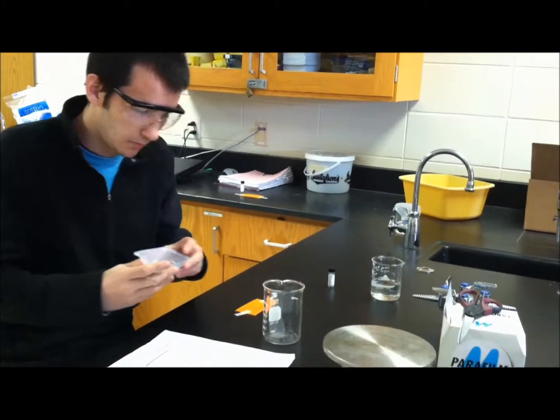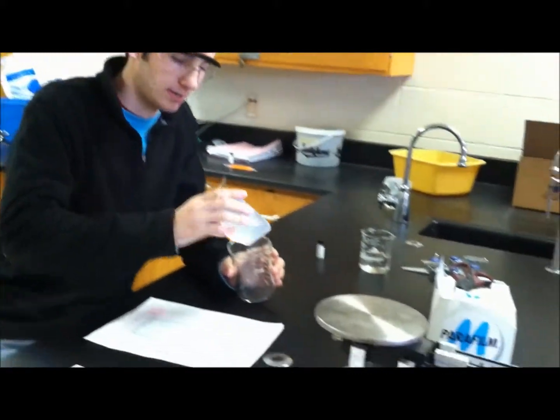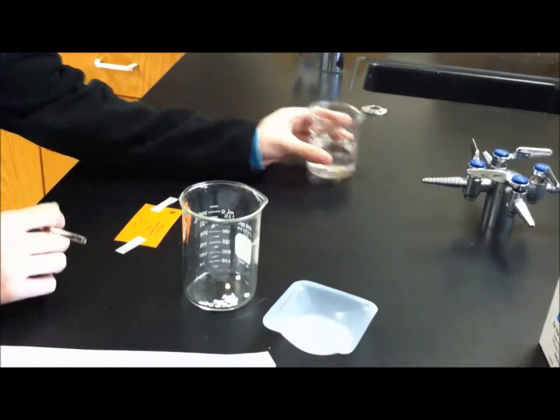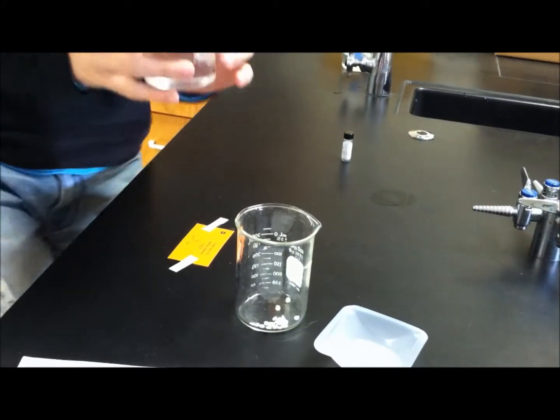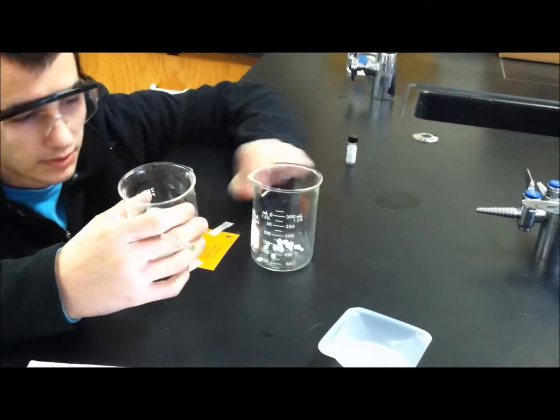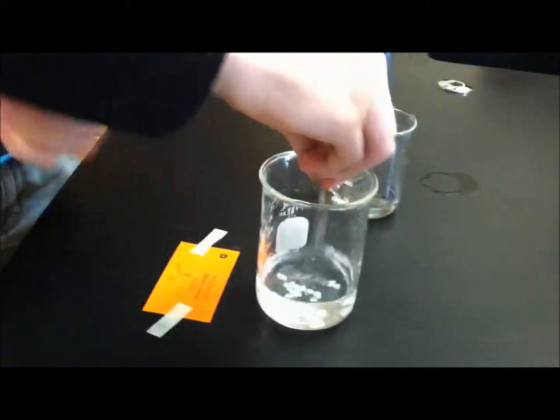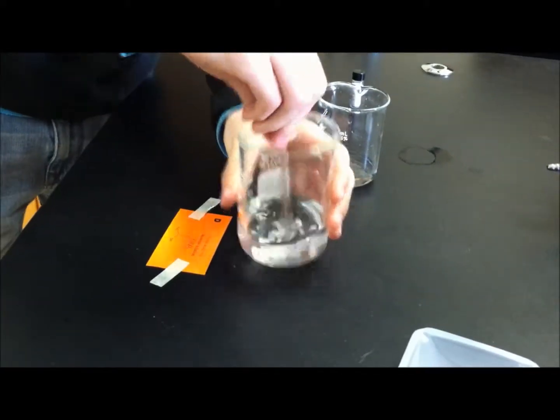Alright, so step 2 is we will be taking our 1.9 grams of sodium hydroxide, and we want to make 100 milliliters or 0.1 liters of our base solution. So what I'm going to do is add this until it hits the 100 milliliter mark down here. See here? We need the acid. Yeah, that's about right. Now I'm going to mix for the chemical reaction. This is an exothermic reaction, so energy is given off. And these sodium hydroxide pellets should react with the water and create our base.